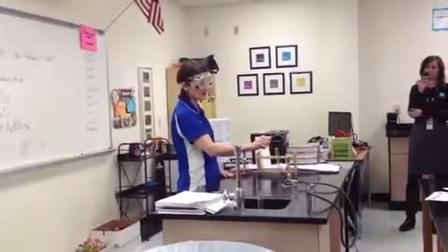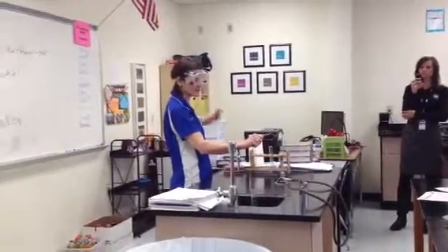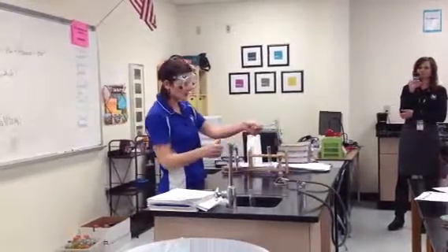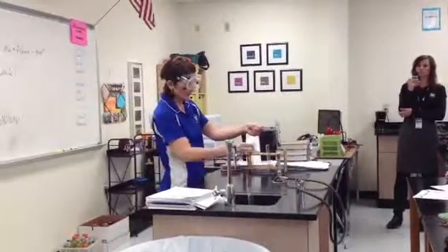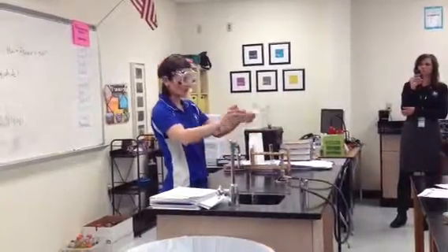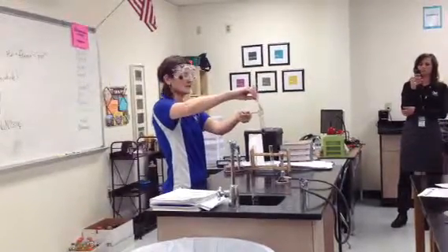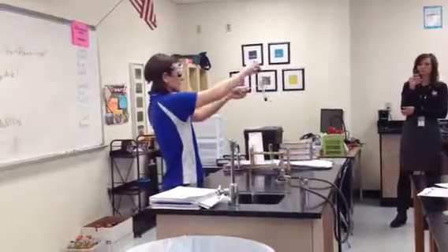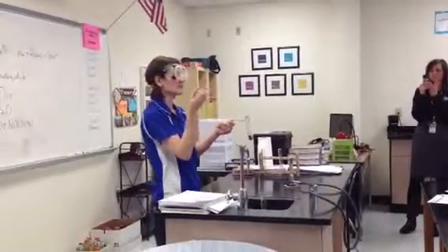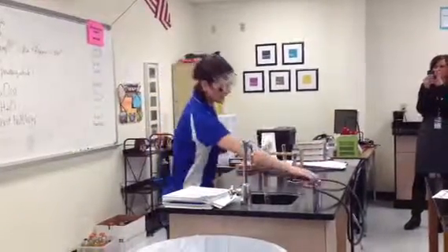Okay. So next we're going to test for carbon dioxide in this test tube. Remember we tested for hydrogen in a test tube and it made a popping sound? If I put a flame in carbon dioxide, what do you expect to happen? It will go out. It did turn green from the copper. But you see that the carbon dioxide did extinguish the flame. So that is a positive test for carbon dioxide: if you put a flame in its presence and the flame goes out.